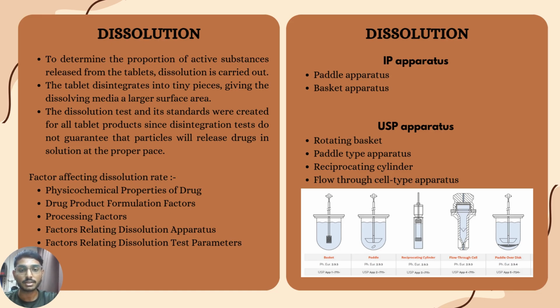As for the dissolution test, we will use IP apparatus and also USP apparatus. As for the IP apparatus, we will have paddle apparatus and basket apparatus. As for the USP apparatus, we will use rotating basket, paddle type apparatus, reciprocating cylinder, and also flow through cell type apparatus.